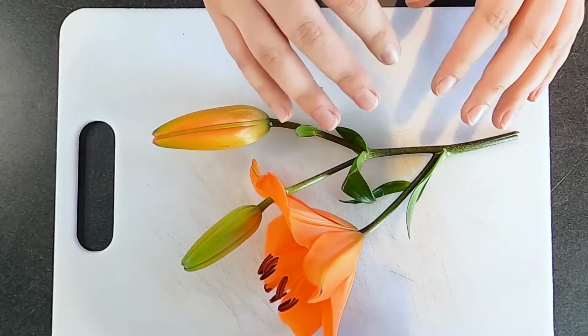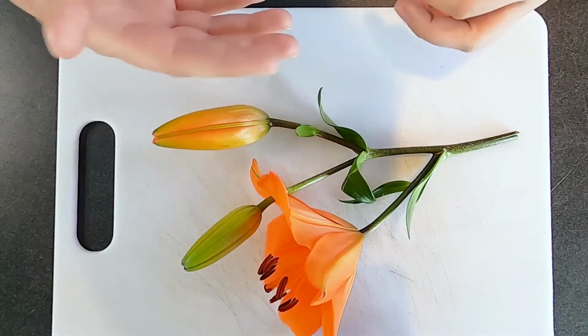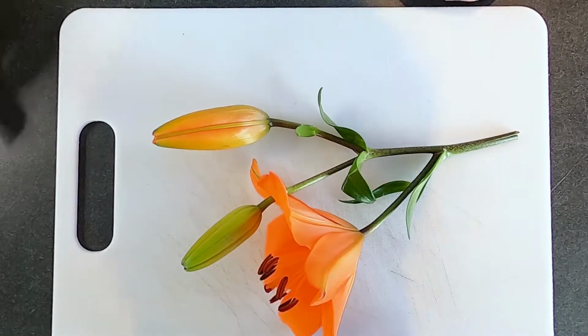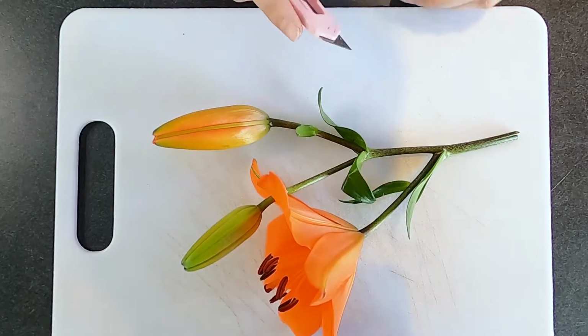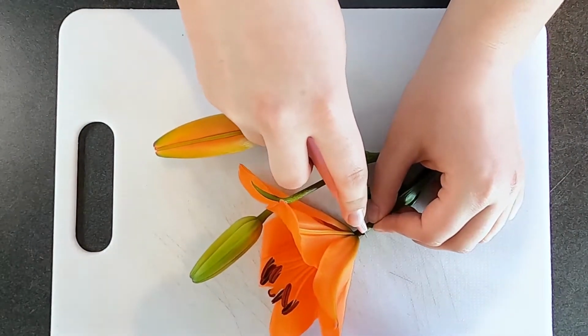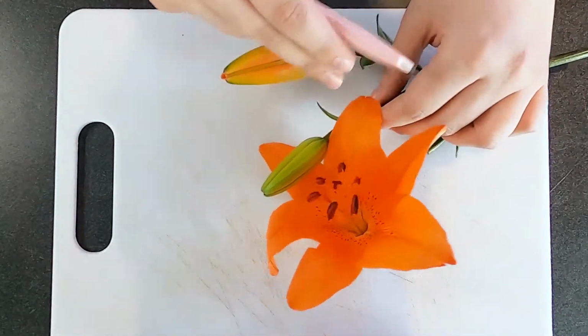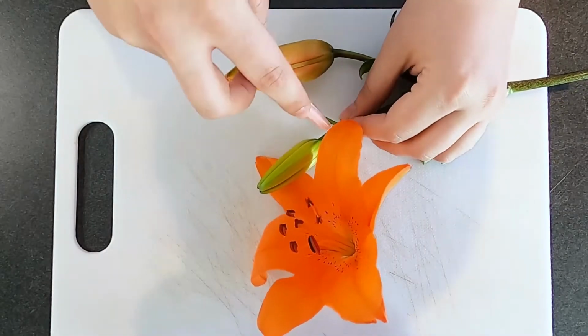They're all very important in order for this flower to have these beautiful colors and to be able to grow up big and strong. So what I'm going to be doing now is cutting off the stems and the leaves and separating them so we just get a flower. I'm just taking right here, and I'm also going to take these other ones off that aren't open.